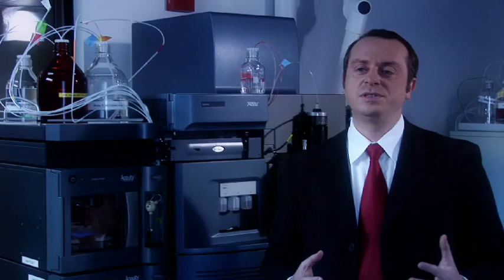We have tools that will interrogate proteomics data and tools that will interrogate small molecules data. You can branch off from metabolic ID data to metabolomics data. Just to give you an example, MetaboLynx or MassLynx. We have all the right tools that will allow you to interrogate information in a very quick and efficient manner.